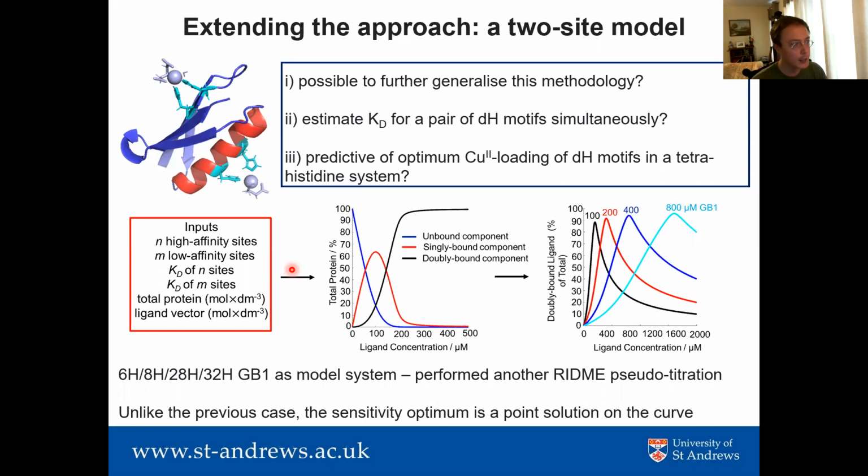So as a matter of safety, would it be a requirement that a protein doesn't contain other histidines, arginines, and such like? Because proteins are held together by literally the equivalent of a few hydrogen bonds in energy, and now you introduce something that strongly coordinates. Can it completely destroy the protein if there are too many?